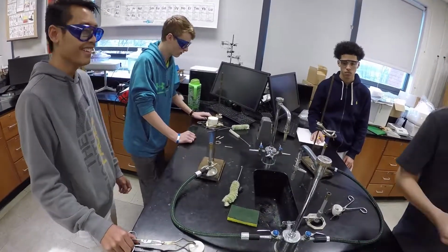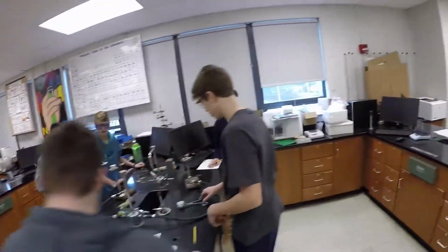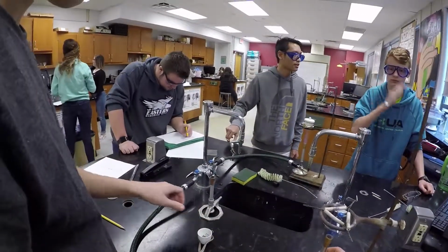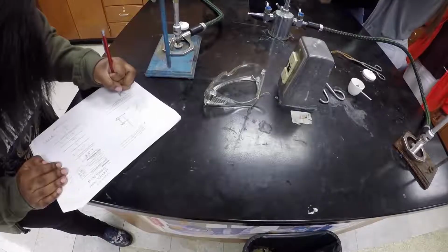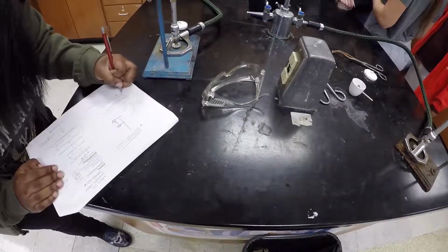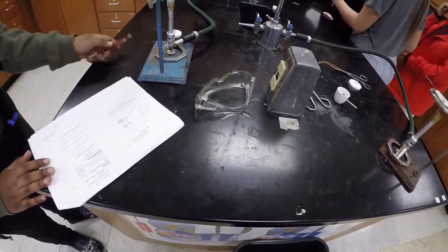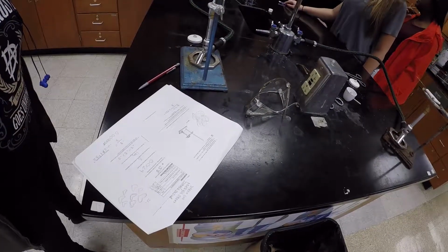The goal being the ash to weigh more. The ash should weigh more than the metal, based on the mathematical data. It's 0.8? Yeah, because remember we were supposed to get around 0.8. So your error is going to be fairly low. I'd say it's probably going to be around maybe like 5% to 10%.